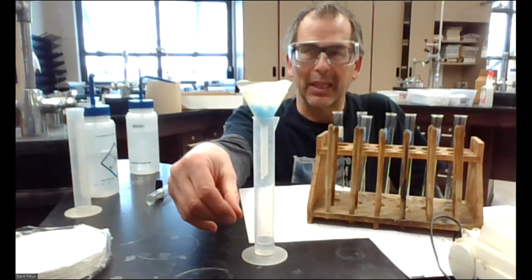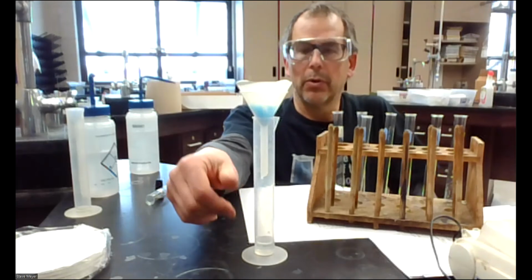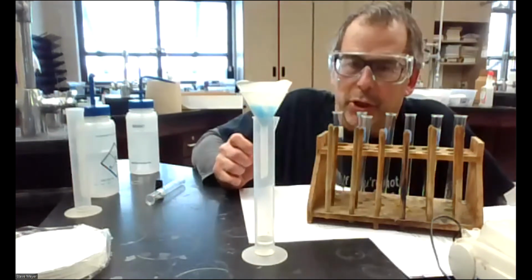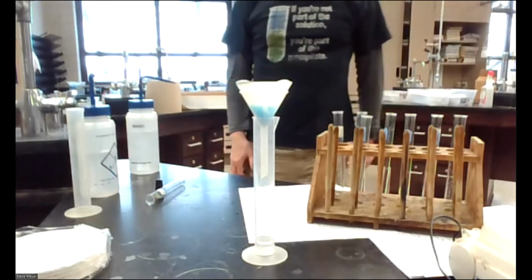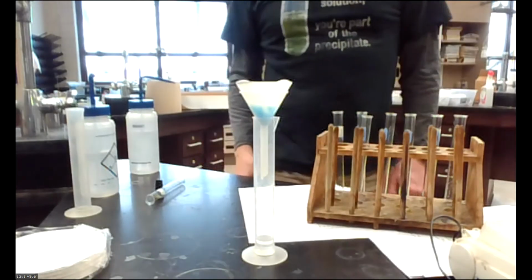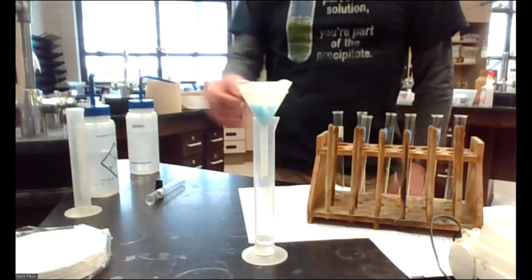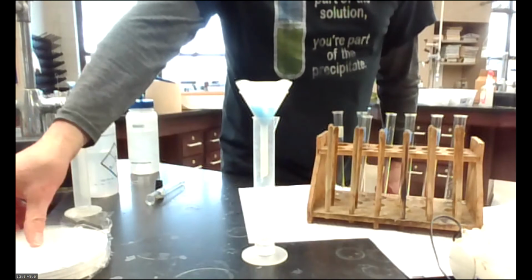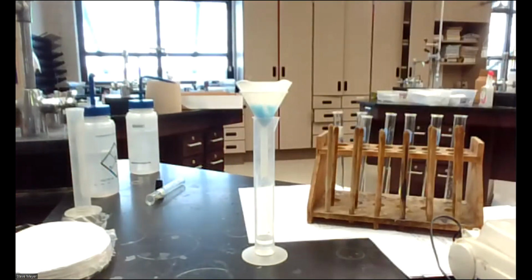Okay, and I would let this go, and ultimately what I'm going to do when it's done filtering is I'm going to spread that out and leave it to dry overnight, or in this case over the weekend. And I think I'll just model that here. It's not quite done, but I'm going to model how it would be going. I'll probably have a plate or something that's labeled, and then I'm going to have a paper towel that's labeled.